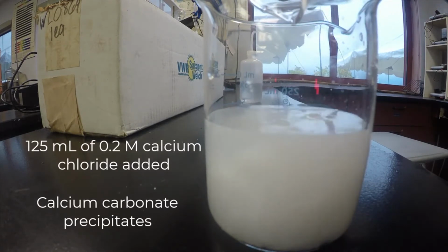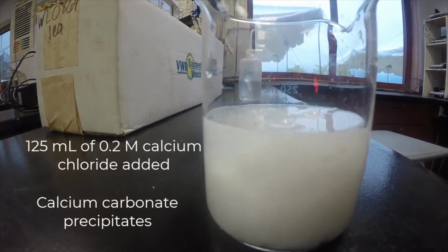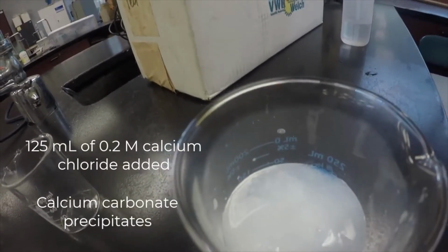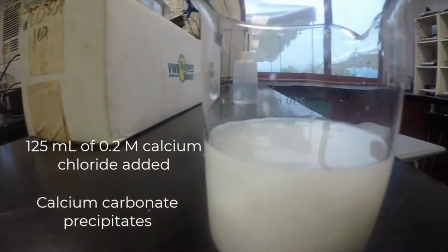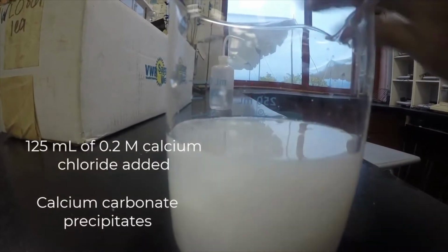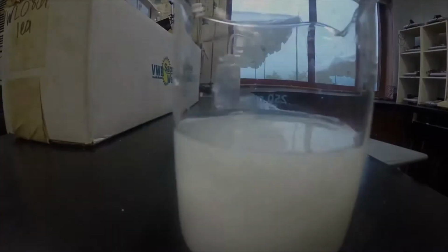Okay, so notice that the solution becomes very cloudy. Let me kind of look at the top. Sort of looks very milky. That white color that you're seeing is the precipitation of the calcium carbonate. Over time, the calcium carbonate will settle out and move to the bottom.